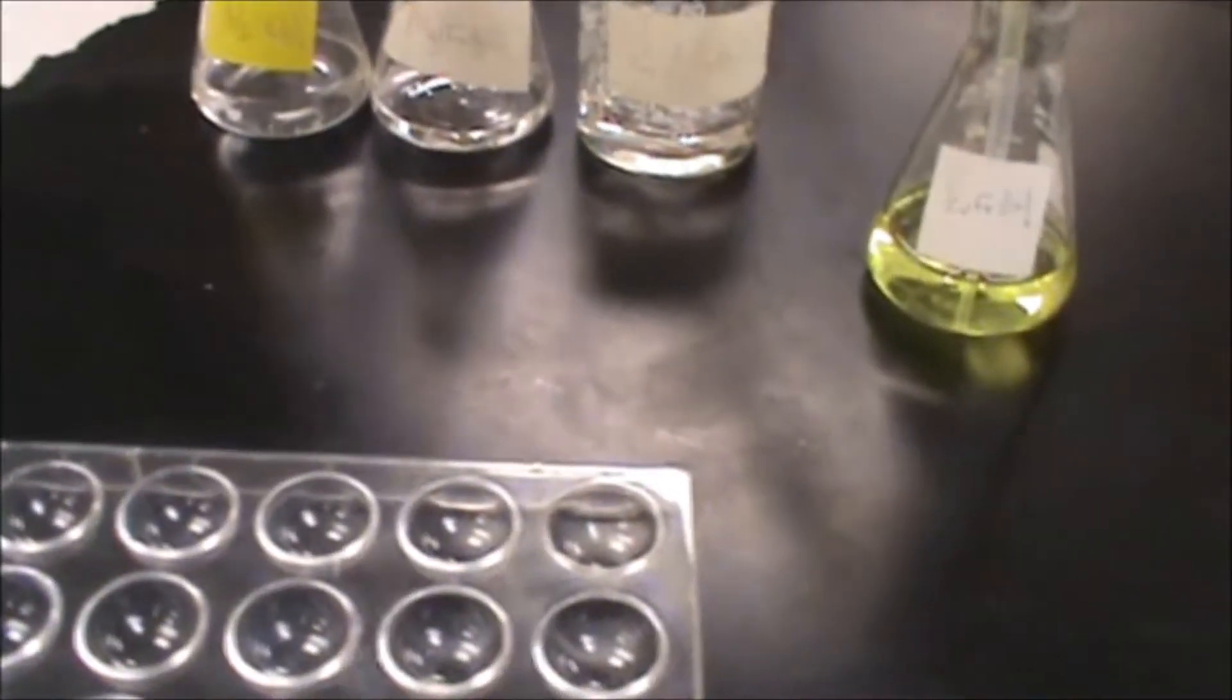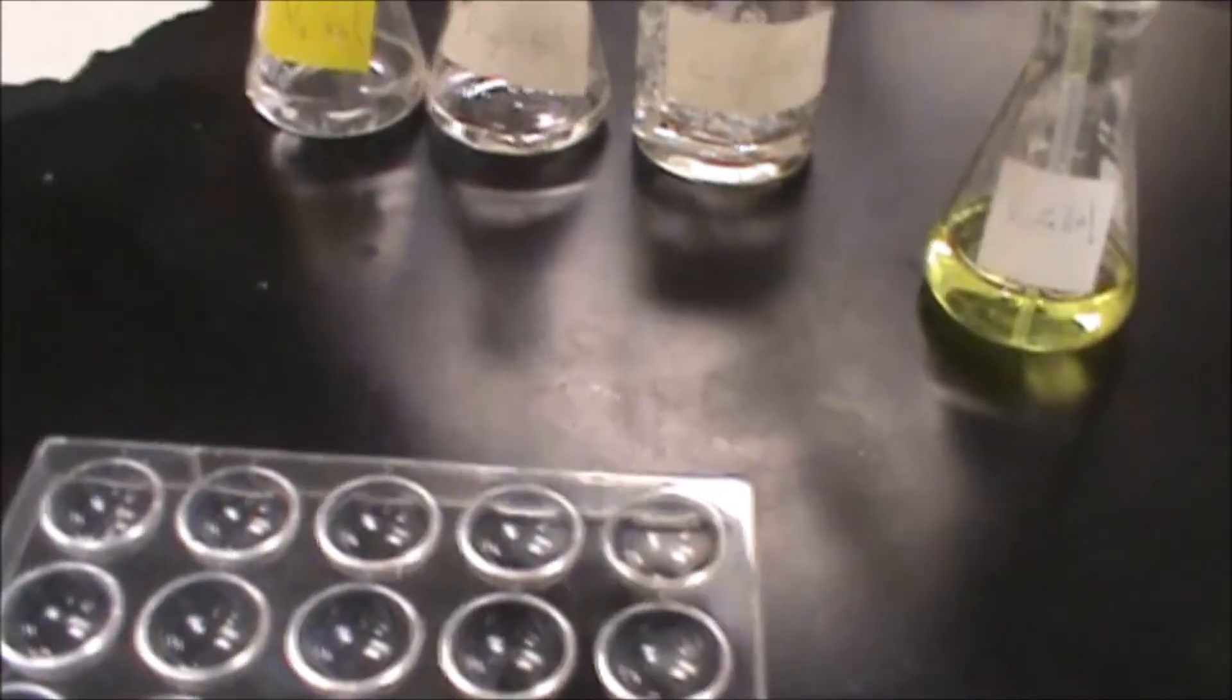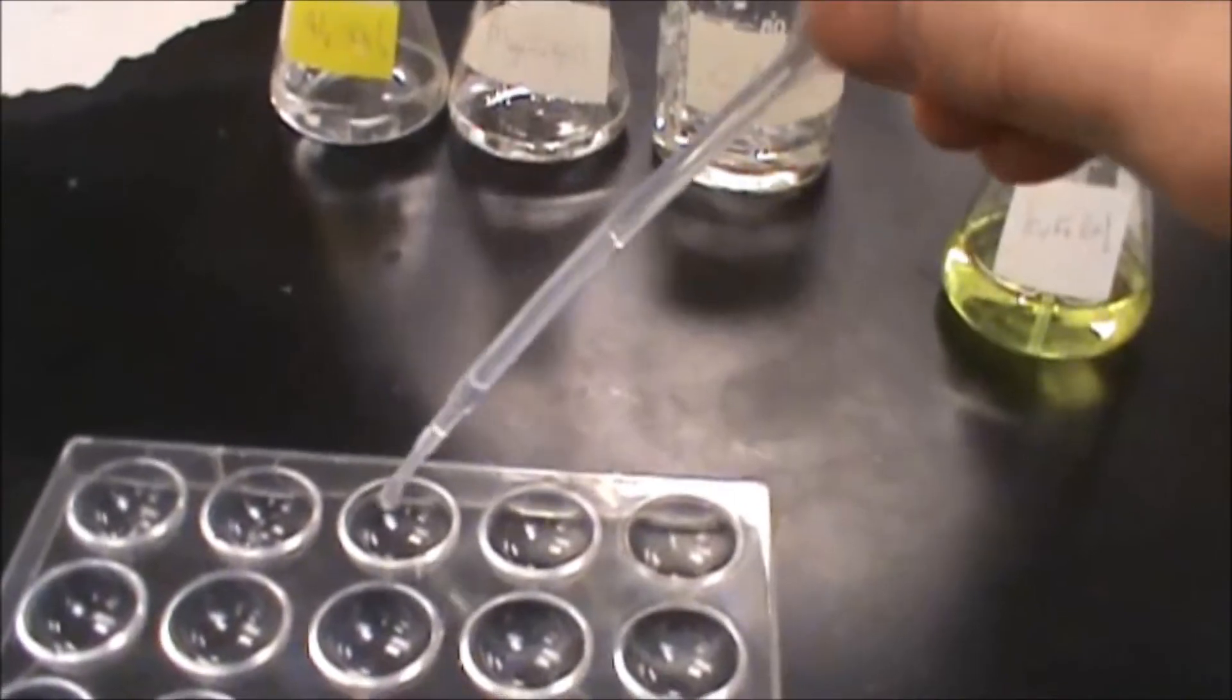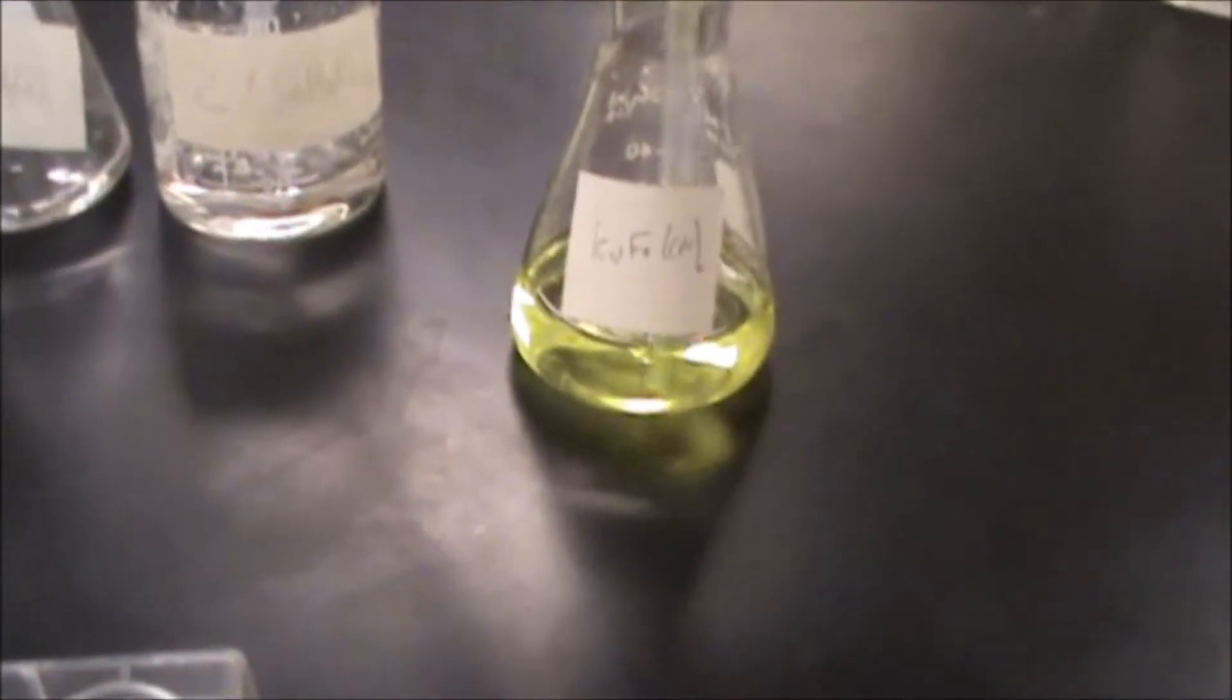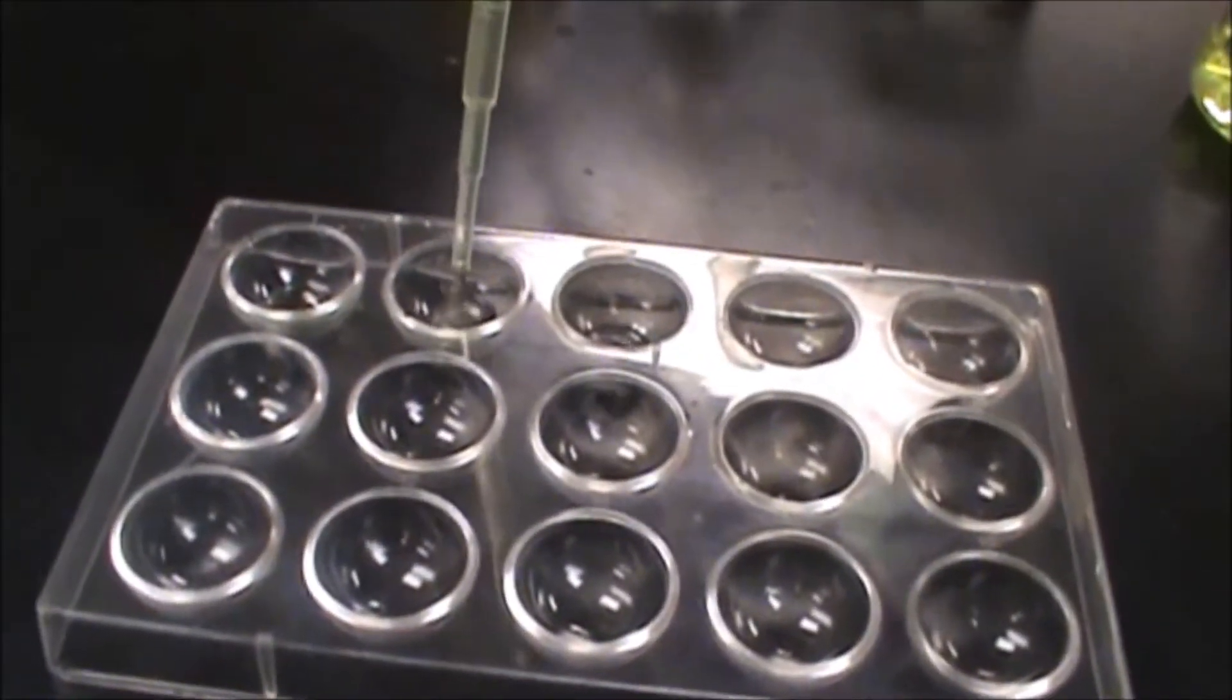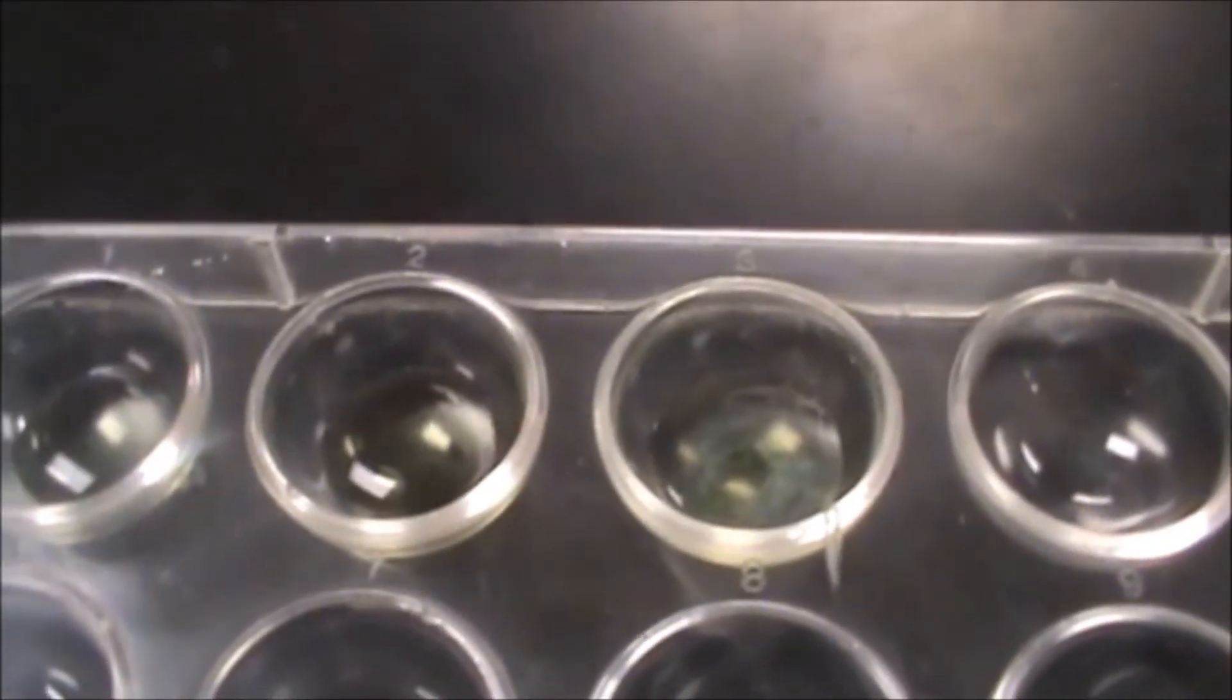So first we are going to take a drop of Aluminum, drop of Magnesium, and drop of Zinc, put it into here. Then we are going to add some potassium ferrocyanide to it, and what is going to happen there is that one of these is going to precipitate, the other two are not.